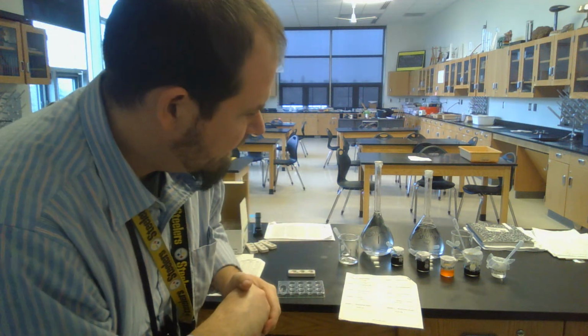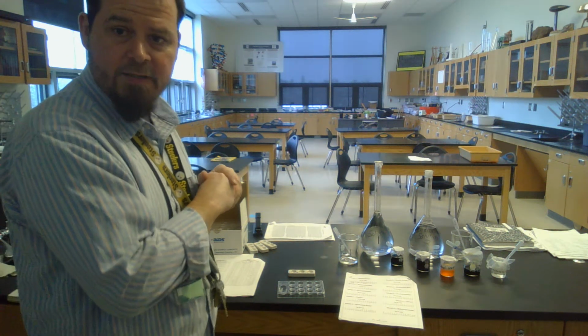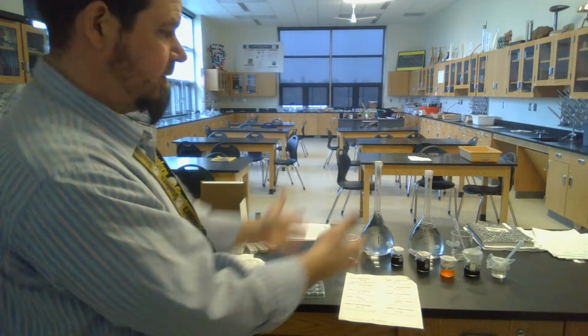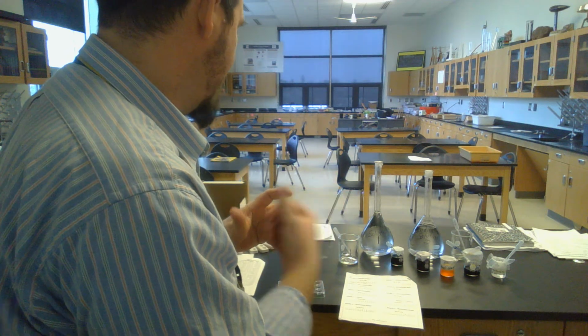And notice the phenolphthalein looks very familiar. It is the same phenolphthalein that we're using for the titration lab that is still up and running. So now we have to share between titrations, and we have to share here. And sorry about that, but I just don't want lots of phenolphthalein. It does really dry out fast and leave a residue.